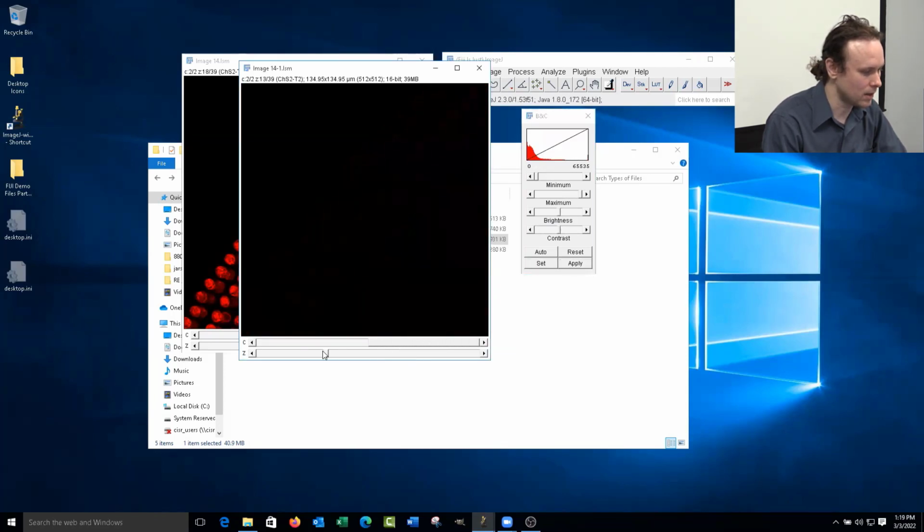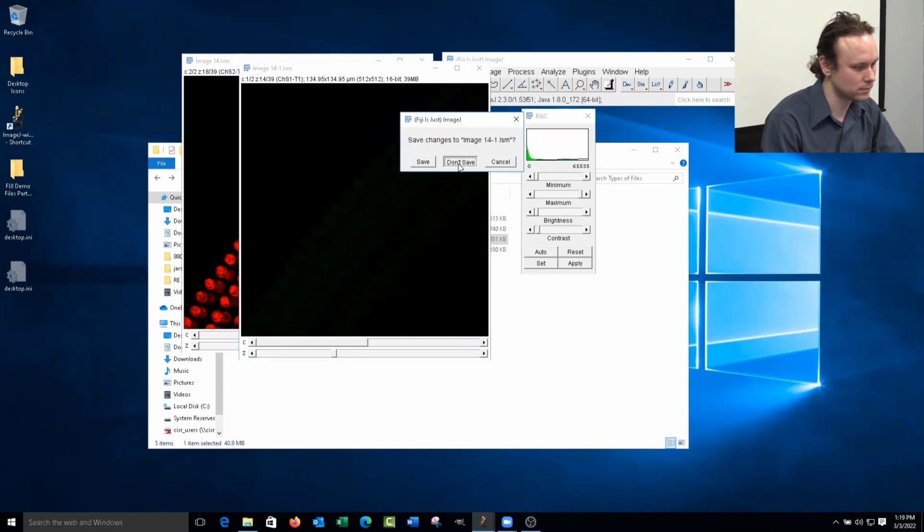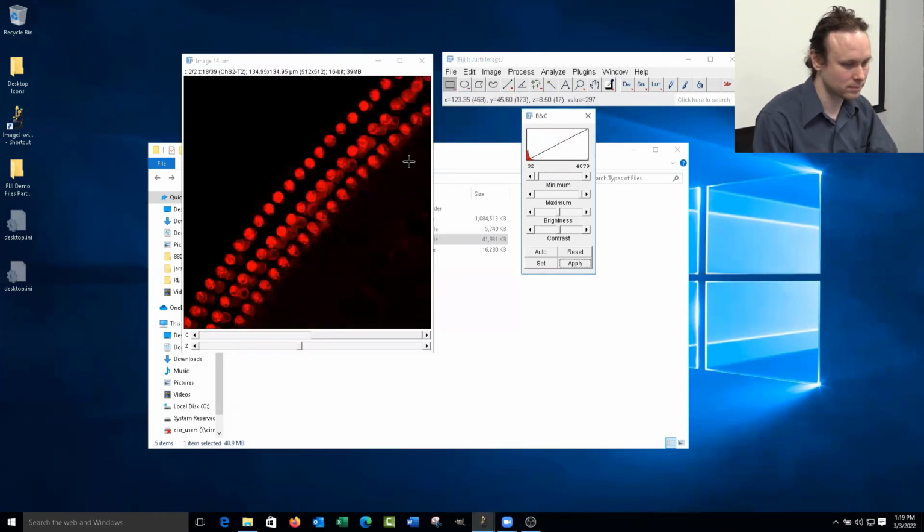All right, so now. We have one question on that topic, if I can jump in with that. Laura, I'm just going to read your question from the chat, but please speak up and elaborate if you'd like. Laura asked, if you change your min-max, does it have to be the same across all samples in your data set? Same question for brightness and contrast.